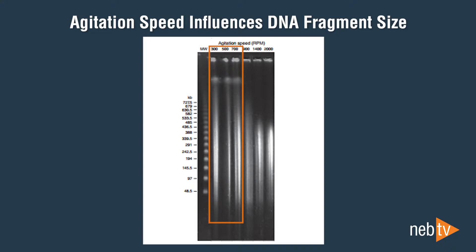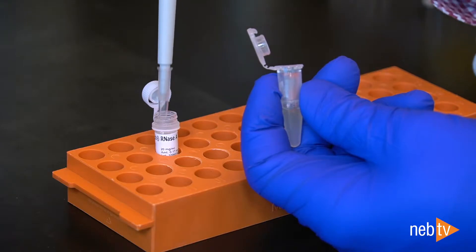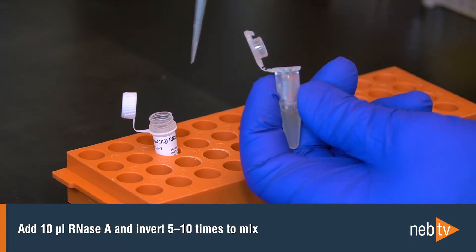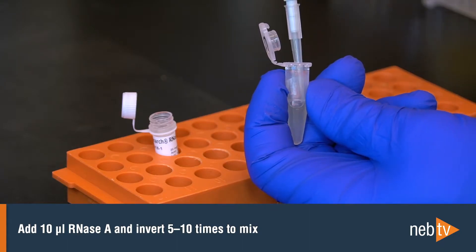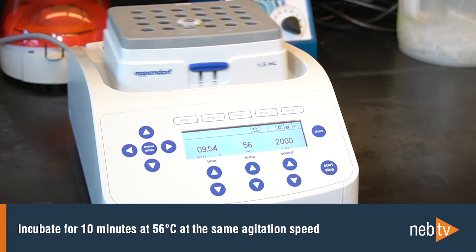With these low agitation speeds, tissue samples are digested very slowly and the resulting DNA will be difficult to handle and more challenging to dissolve after elution. Once the lysis incubation is finished, the removal of RNA can be addressed. Add 10 microliters of RNase A and invert 5 to 10 times to mix. Incubate for 10 minutes at 56 degrees Celsius at the same agitation speed previously used.